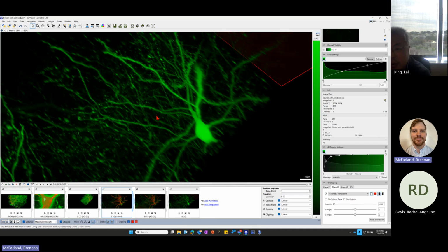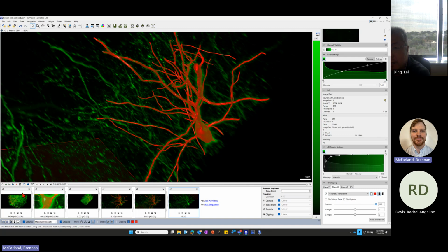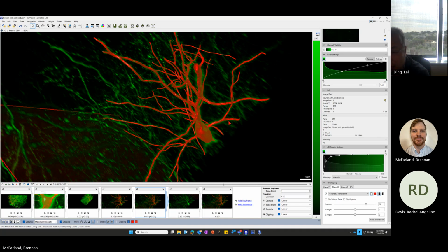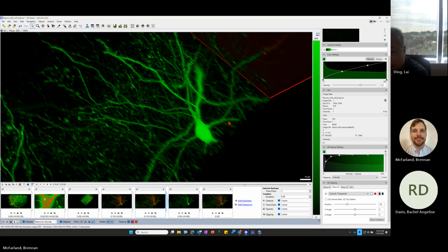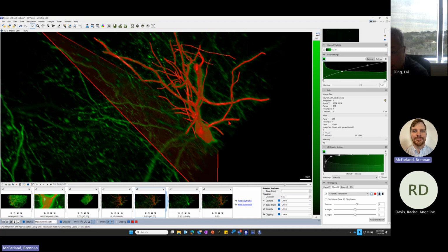If we want to slow this down or speed it up, we can also do that. Then if I want to pop it back on after the fact, we can do that here too. So moving, bringing it back.